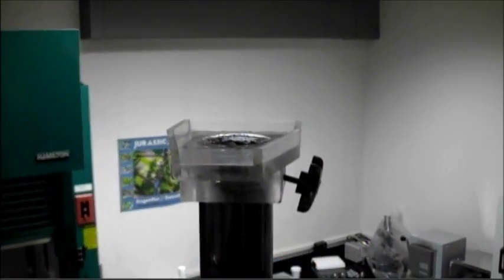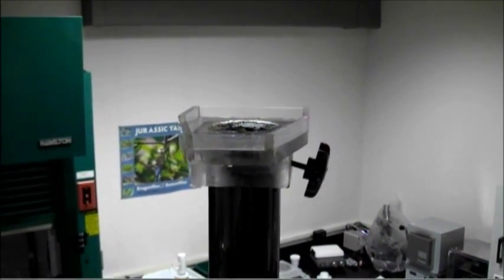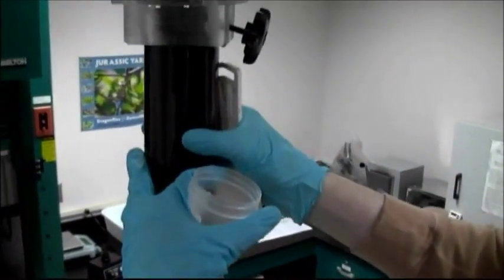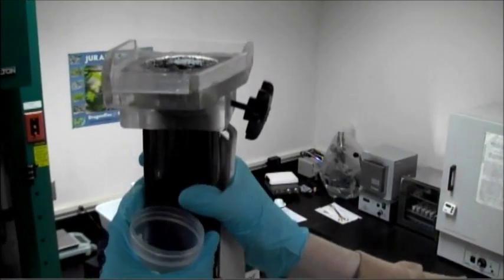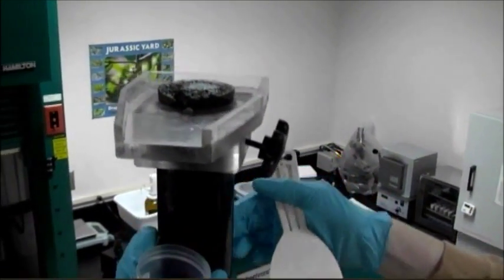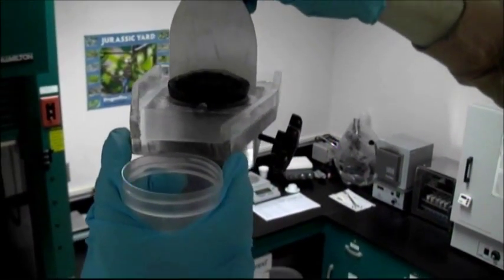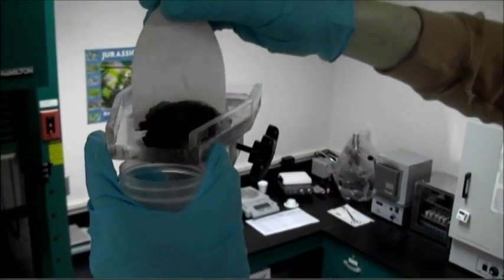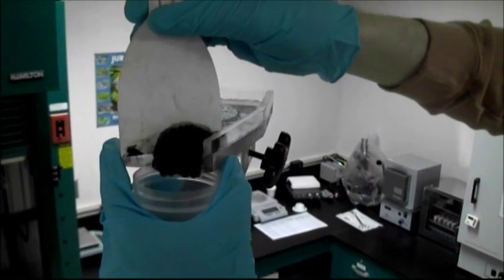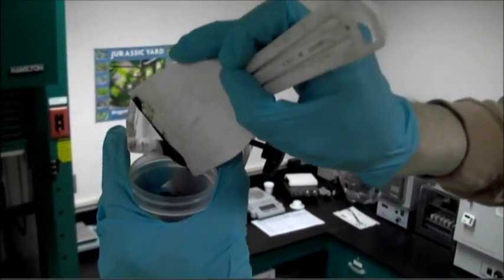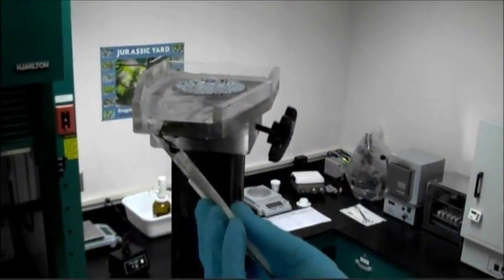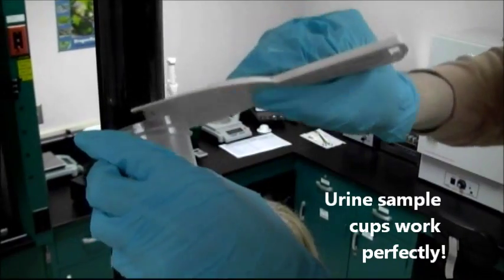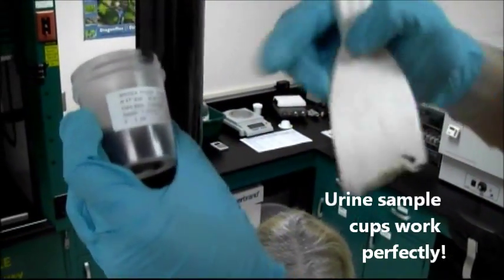Ready for the first one? So let's do the first centimeter of sediment. One centimeter for me. And here it comes. See, it still has a little bit of that Zorbitrol in it. Now we can scrape off the mud. And there you have it. That represents our first interval, what we call our zero to one.